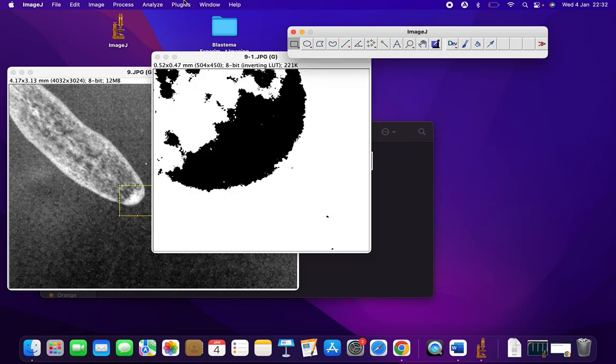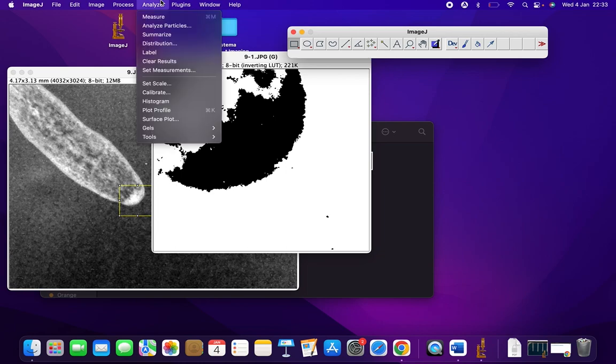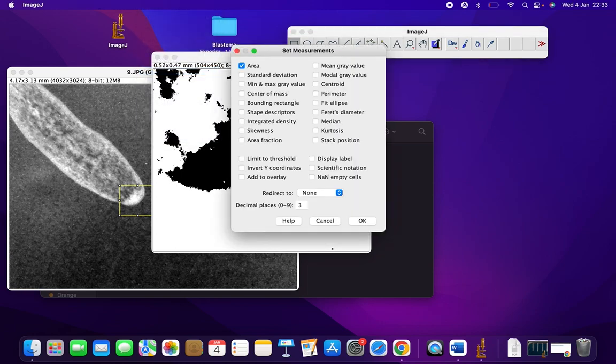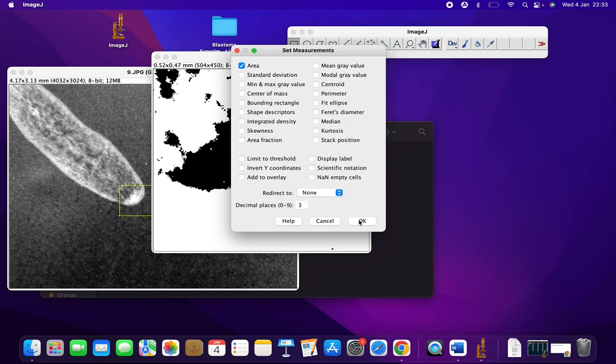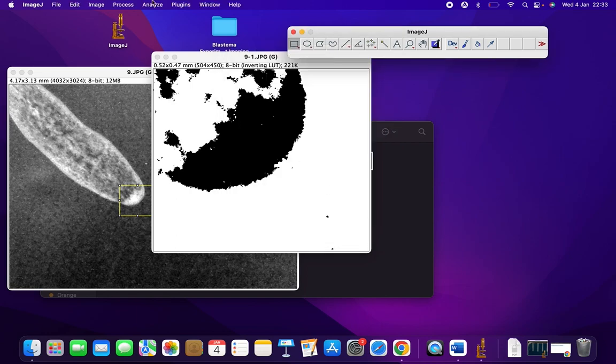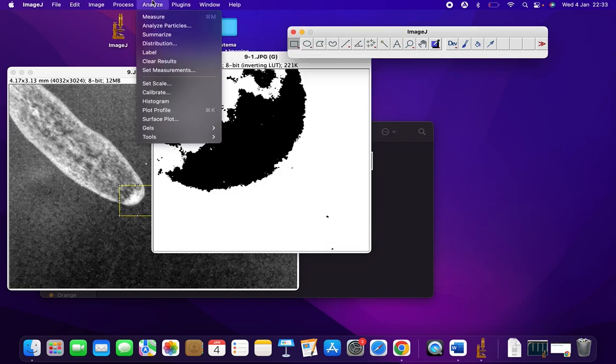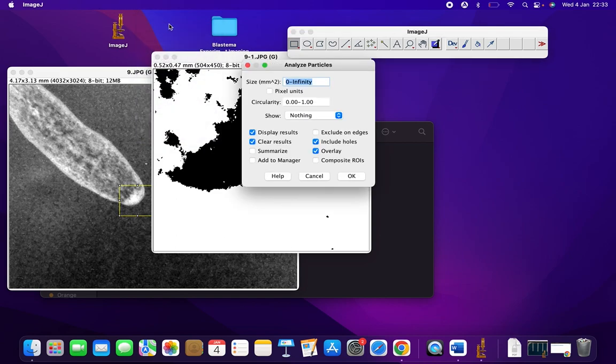From there onwards, we'll go into Analyze > Set Measurements and ensure that only Area is selected and nothing else, and press OK. From there, go to Analyze > Analyze Particles.